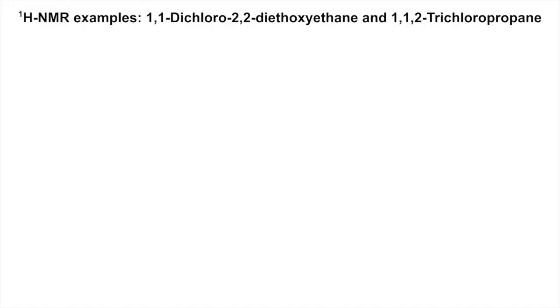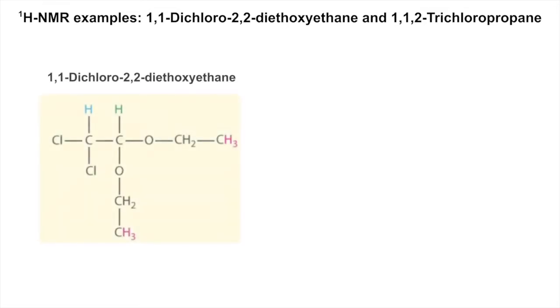Now I'll do the examples of these two molecules, proton NMRs. I think it really helps for you guys to see me labeling them because you're going to be doing the same thing. And the more you see of this, just everything starts to make sense.